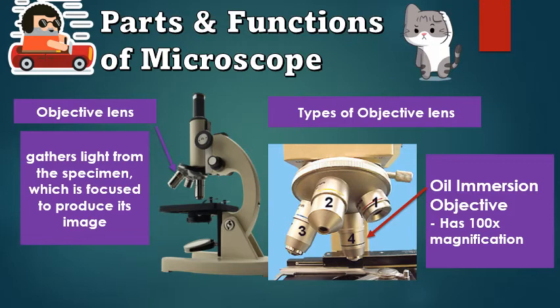You can achieve a clear image by immersing the objective lens and the specimen in a transparent oil of high refractive index, thereby increasing the numerical aperture of the objective lens, producing a clear image of our specimen, even if it is a very tiny organism.